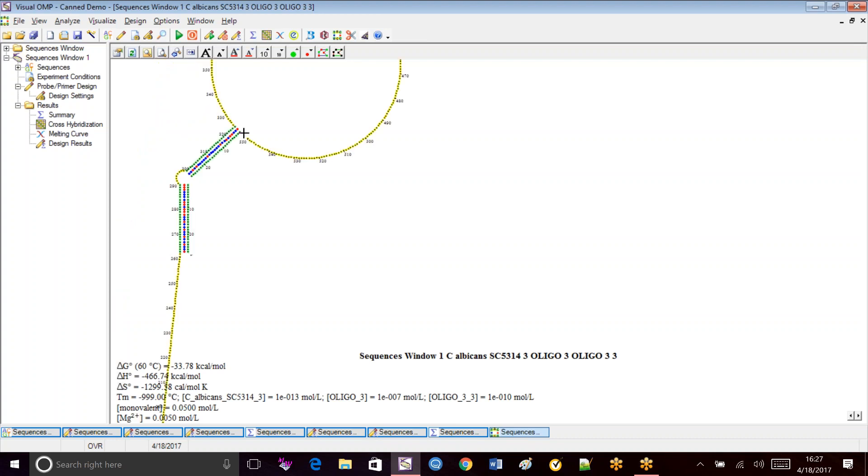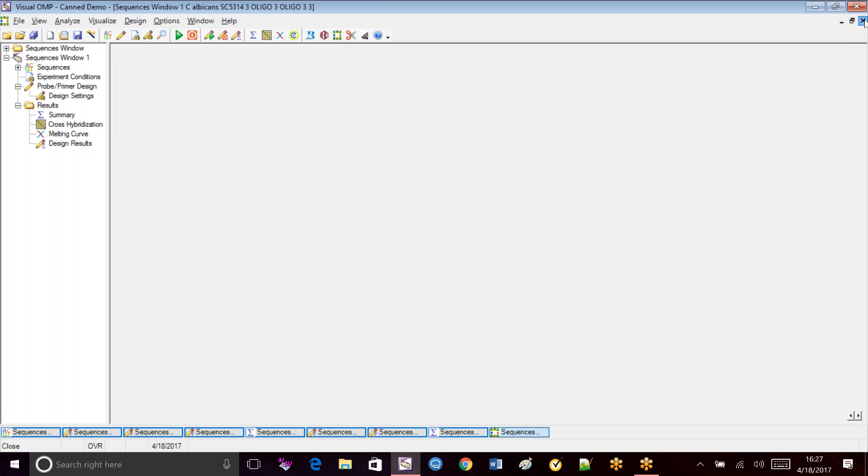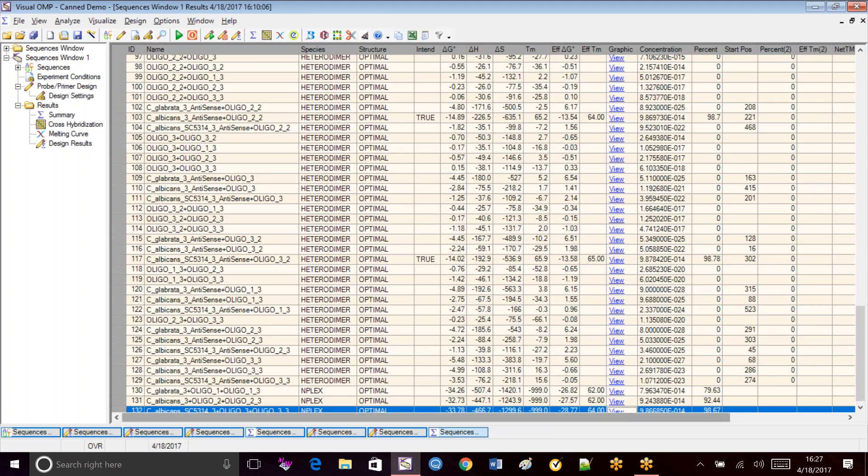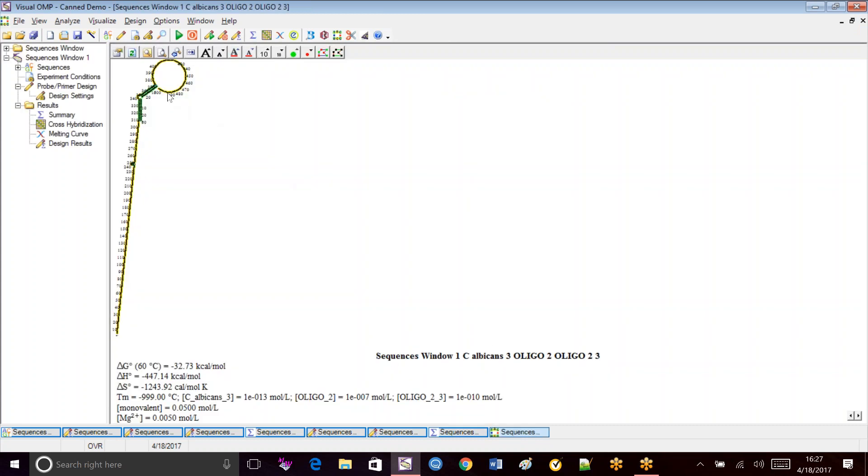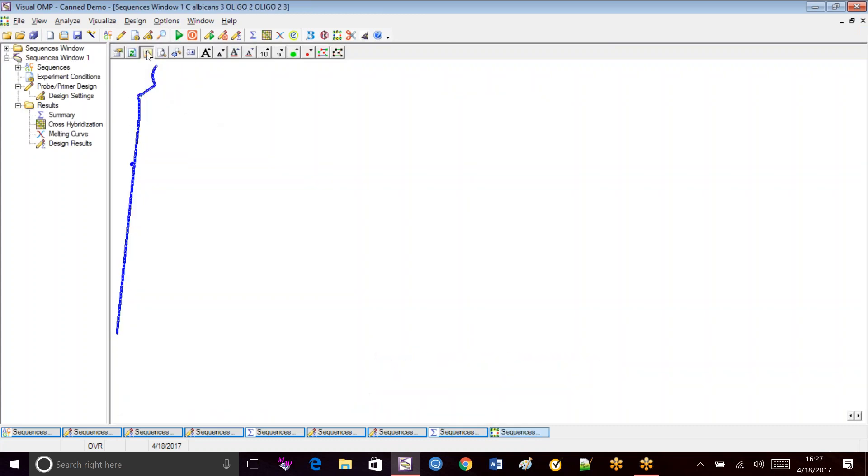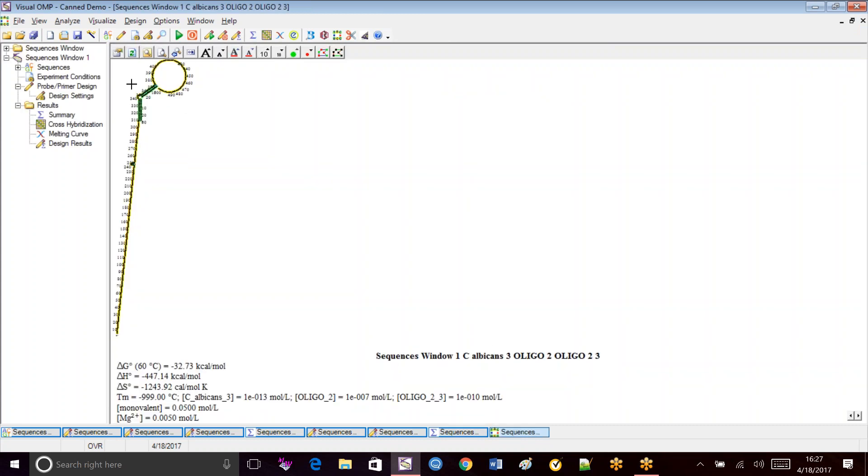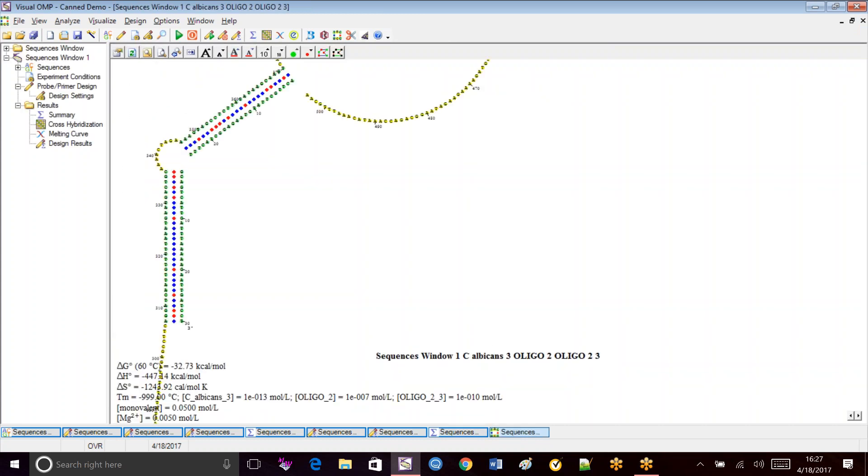Use the control bar. We see we have the primer, then we have the probe right next to it, about 10 nucleotides down. So that looks nice. We look at the second one, see something very similar.